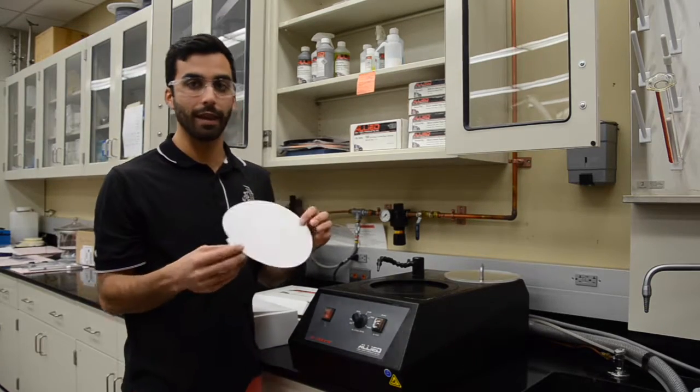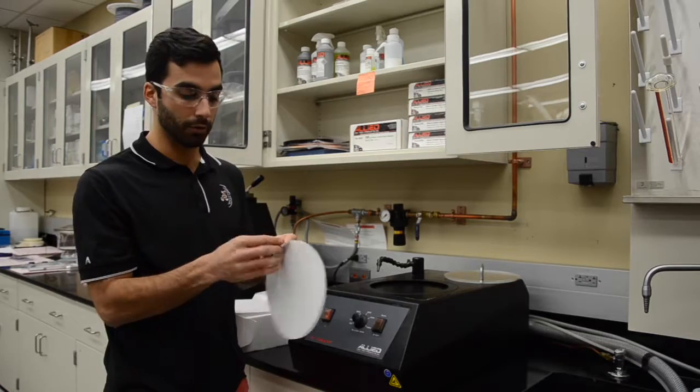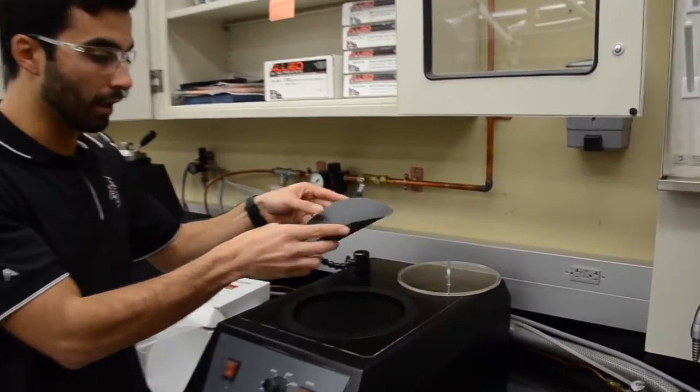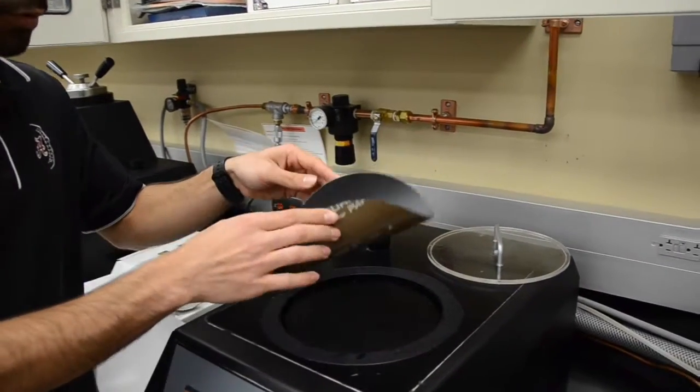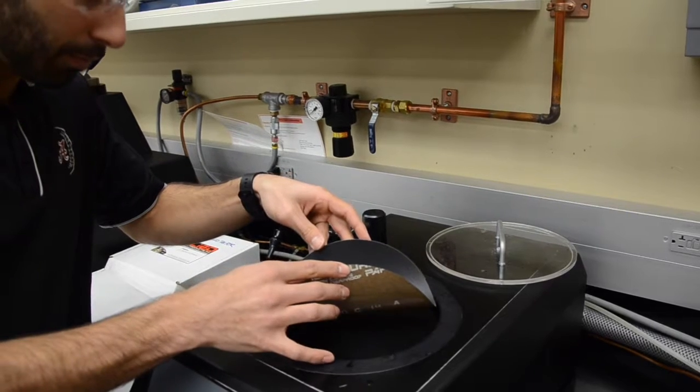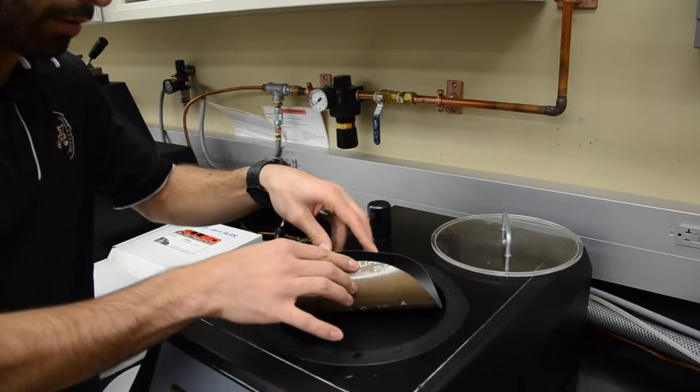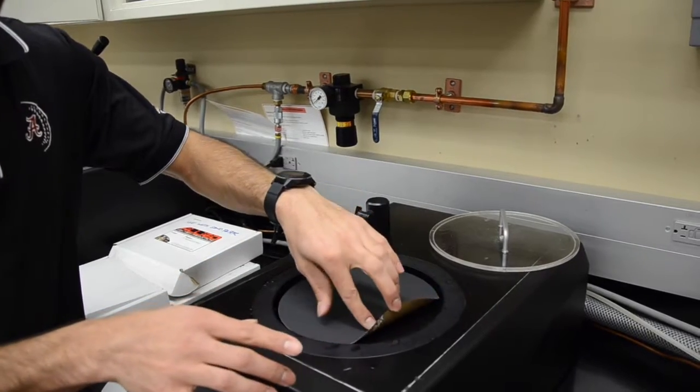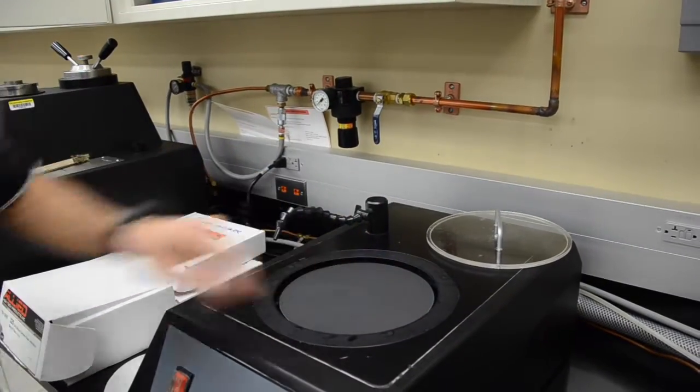Here we have the pad. It's an adhesive back of sandpaper, so you just peel the back. To put it on the platen, to avoid air bubbles, you want to basically bend it like a taco. Put it down and then slowly place it down. That way we try to avoid the air bubbles in between them.